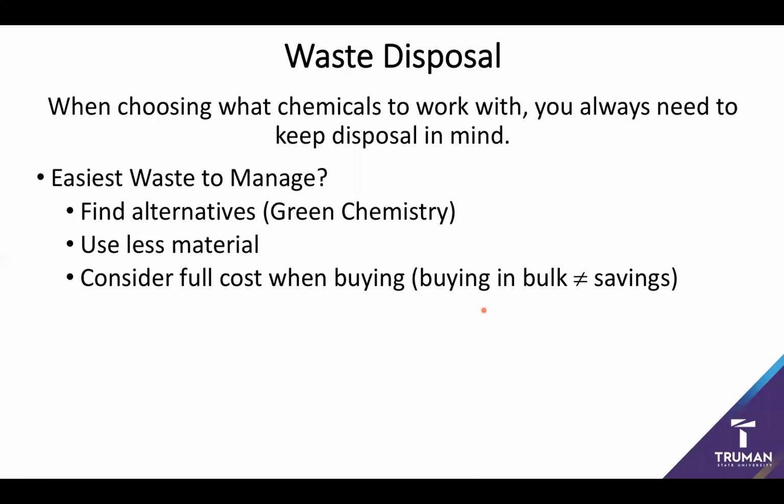We also have to pay to store chemicals, because we can only keep so many chemicals around for so long. If you're not going to use it, you probably shouldn't buy it. So even though it might seem cheaper, think about how much you actually need.